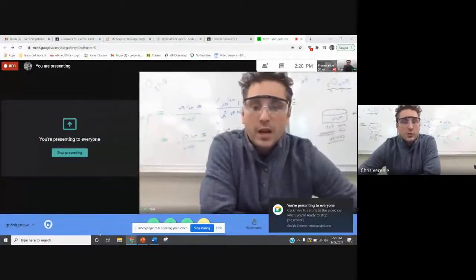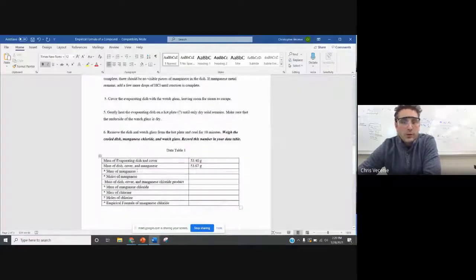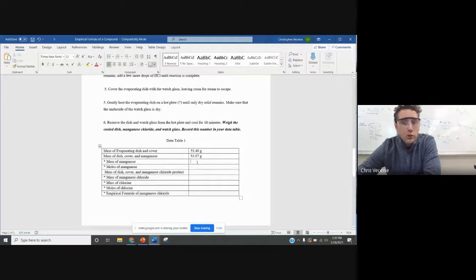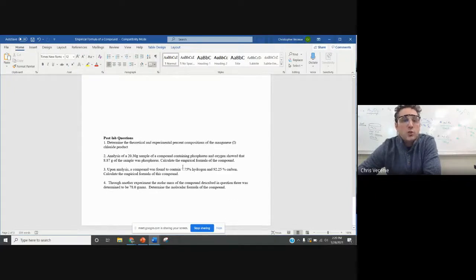Okay. All right. So if you guys take a look. We're still just sitting right here. You can do your star calc for the mass of manganese. You can do your star calc for the moles of manganese. I already talked you through those. We still wait on this number, so you can't do any star calcs after it until we get that number. What we can do, though, is do some PostLab questions.